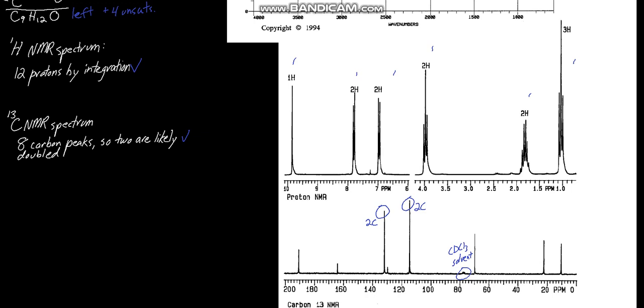Let's look at the proton NMR and let's look at the methyl group here. Why do I know it's a methyl group? Not many other things can integrate for 3 hydrogens. This methyl group is split into a triplet, which indicates that next to that methyl group is a carbon bearing 2 hydrogens. You can look at it as if these 3 hydrogens create 1 signal split 2 additional times to give you a triplet, and that's exactly what we're seeing.